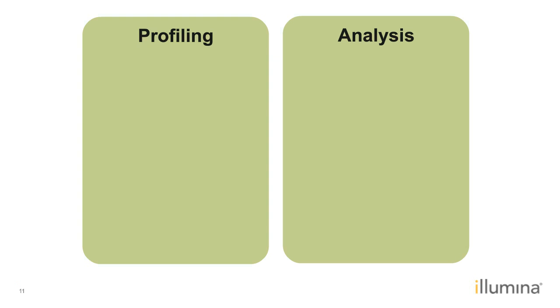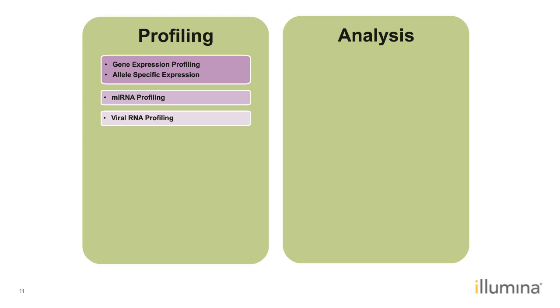When we're trying to decide what kit to consider, we want to take a step back and ask what our RNA-Seq applications are and what questions we are really asking. We can generally divide them into two buckets, profiling and analysis. Profiling is going to be more counting. So what is the gene expression, or changes in gene expression in response to treatments or various cell types?